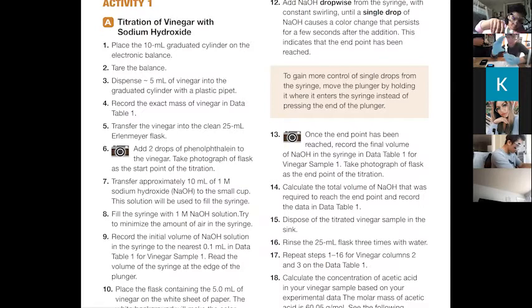Of course, remember, the amount of sodium hydroxide you add is dependent on the amount of vinegar you have. So maybe not everyone used exactly the same amount. Okay, so we should probably slow down. We used 5.38 grams, 5.31 grams. So if you use less or more, obviously it's going to be a little different. So we're really close, are we, Ron? Pretty, yeah. Okay.